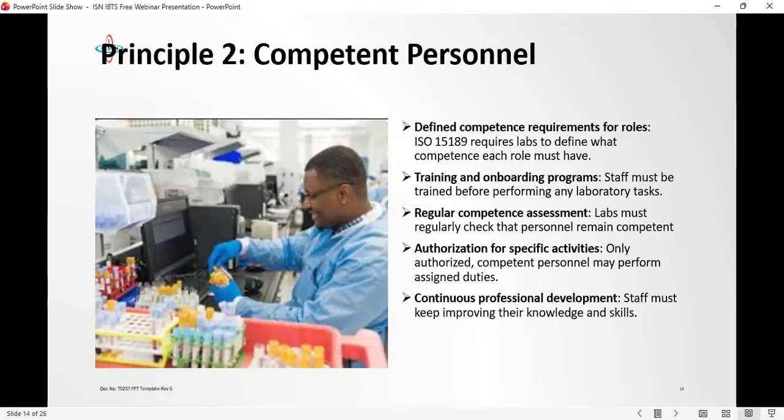It is watered down. If it is not documented, if you do not have a plan, okay, if this person comes in, the person first of all has to go through how registration is done, interact with the client, go to your phlebotomy, find out the phlebotomy requirement, go to the lab. This is the process that happens in the lab. When in the lab, do you just throw them into the bench because they have 15 years experience working on the bench? Your process may be different. They may have training on automation, but are all the instruments the same? Do you have an orientation timeline of which the person needs to observe and internalize your standard operating procedures?